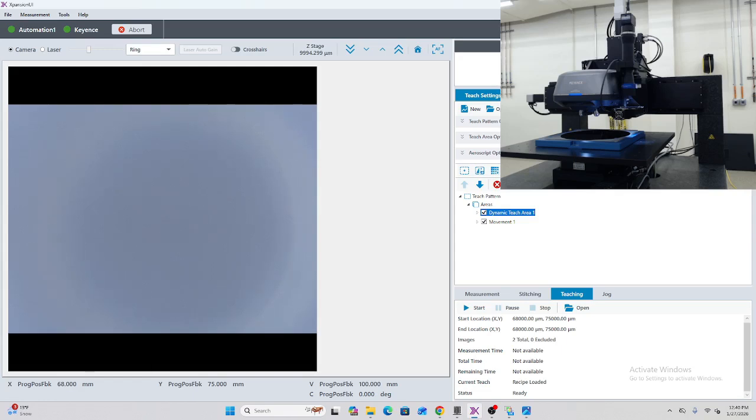As you can see on the video, we have the VKX microscope sitting alongside, in this case, a grayscale line scan camera from Keyence, which is being driven by their XGX controller. That is mounted into a telecentric lens with a light box underneath, allowing us to get the contrast we need to identify our defects. In this video, we're actually going to be looking at a wafer application. We have a bare wafer sitting underneath here, and we're going to take a look at how we're going to use this machine vision camera to pre-inspect that wafer and then drive the microscope to any locations that it finds.